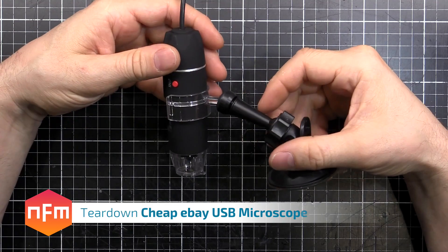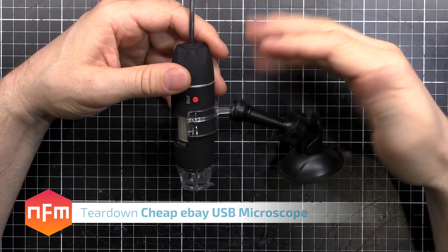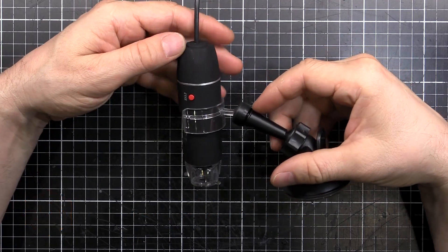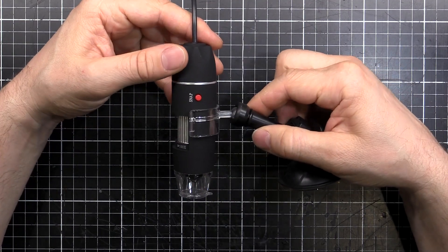I got this little USB microscope off eBay a while back. I had a bit of a play with it but the image quality wasn't the greatest, so I just chucked it into the parts bin and forgot about it. I just found it again and I thought we would take it apart and see what's inside.